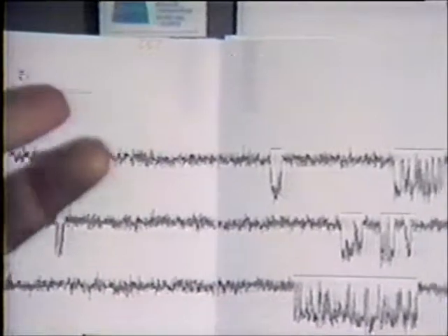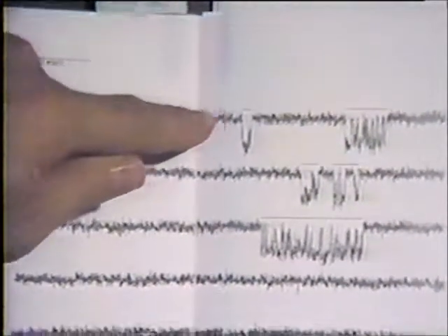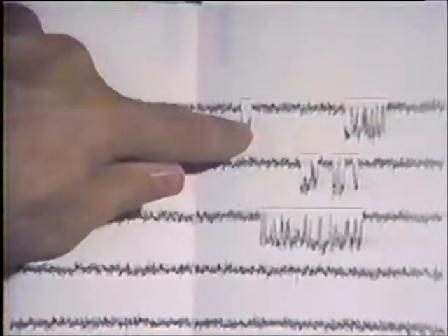The most important part of data analysis is taking a good look at the data. Now, if we take a look at some raw data plotted out by the computer, we can take a look at a few things. This is the baseline level. This happens to be a single channel record from stretch activated channels. Here's the baseline. Here's an opening, closing, stays closed, opens, closed, and so on.